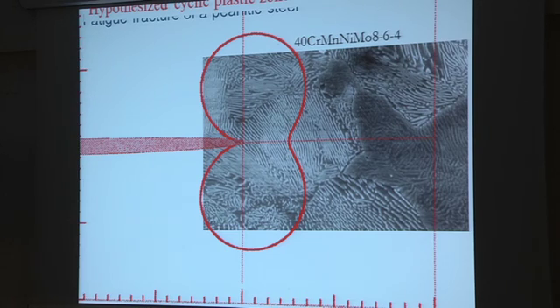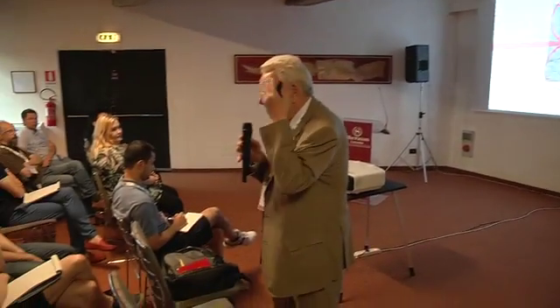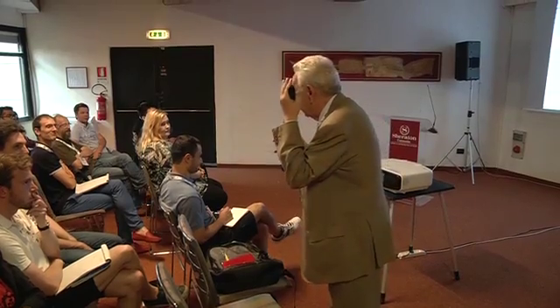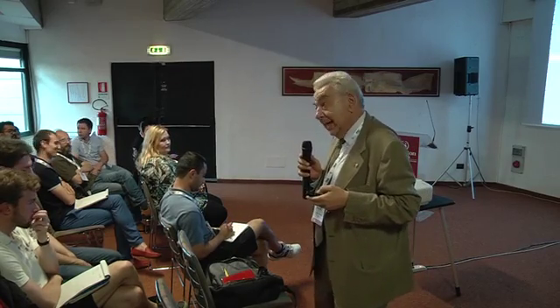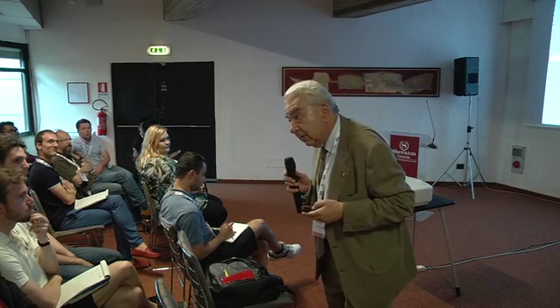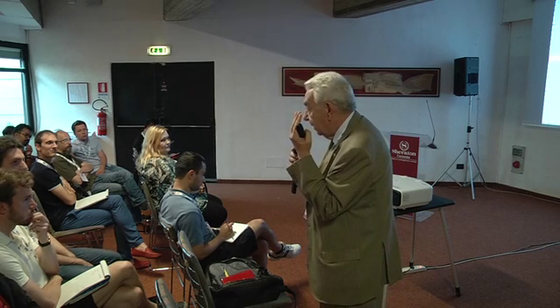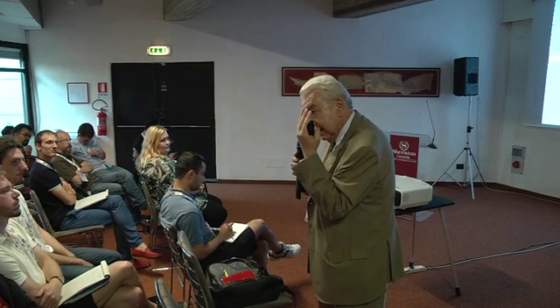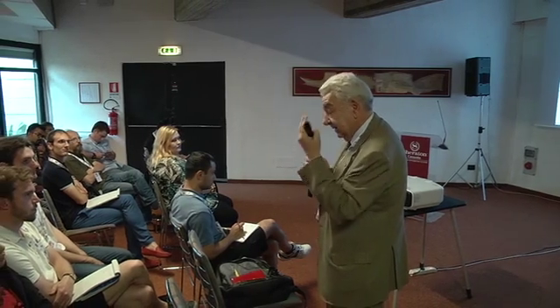And if we have a plastic zone size, the stress goes into plastic and the deformation goes into plastic. And the poor cementite lamella cannot withstand that strain. And so what do they say? My God, that's too much for me. And they break. And then the ferrite lamella remain standing the load alone. It's like the teeth of a comb that withstand the stress one by one, and the crack is advancing.